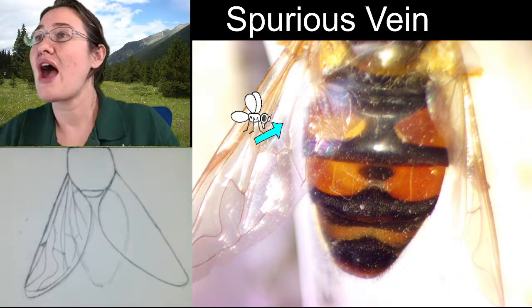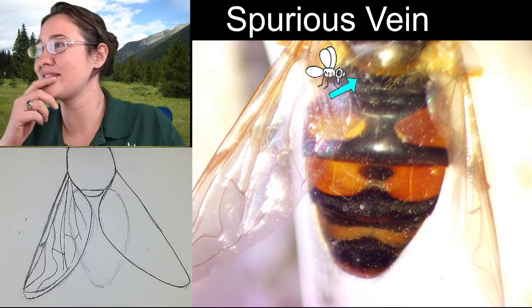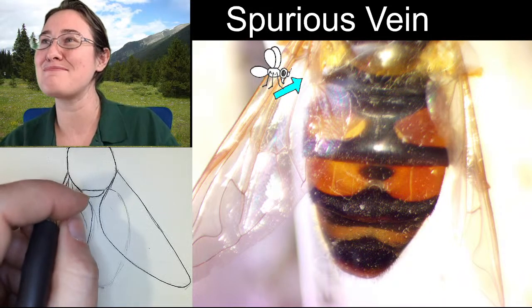All right, so our first segment of the abdomen is up here, and it's kind of short. Bugs don't read the field guides. That's true. How dare they break our man-made rules?